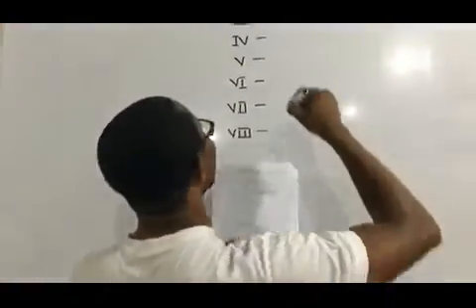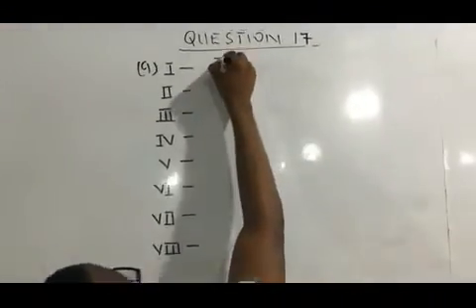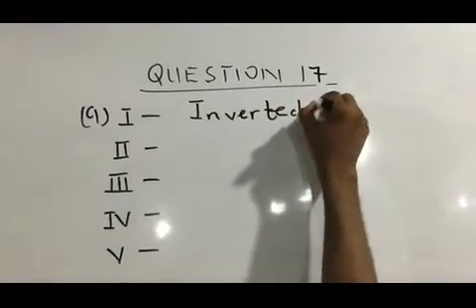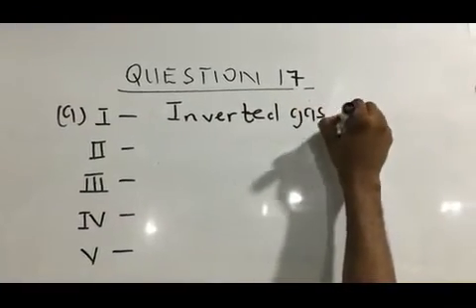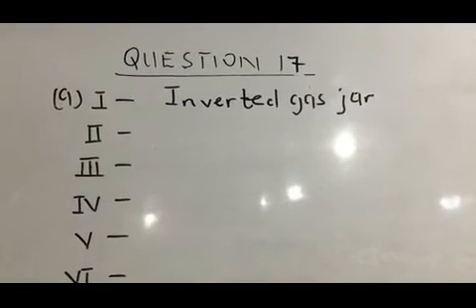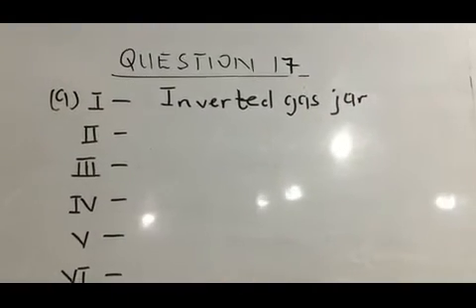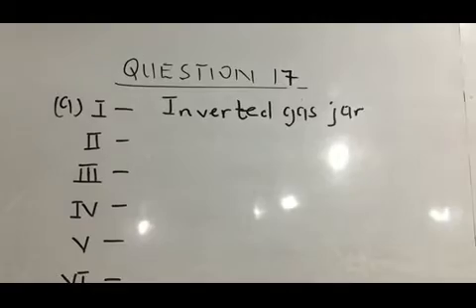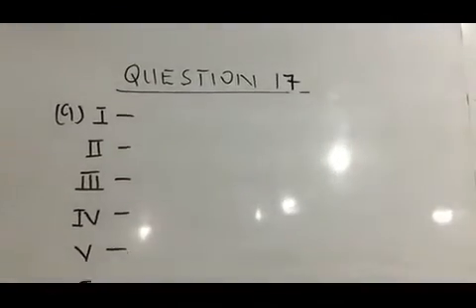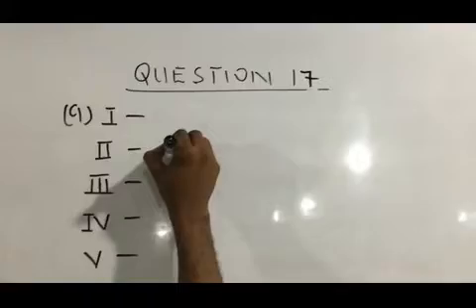So it should be inverted gas jar. Oh no. So the inverted gas jar is rather the II. So this is the inverted gas jar.